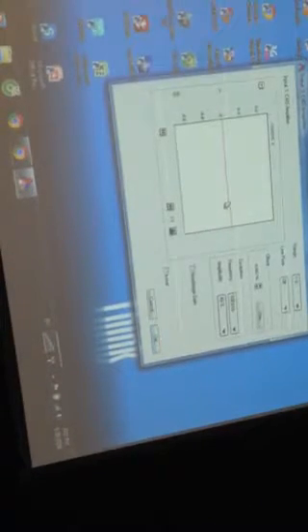The C4D amplifier is a little test window which shows you what's recording. So at the moment I put a capillary in here, and in this capillary there's a little drop of liquid. So as I move this, you can see it's changing.